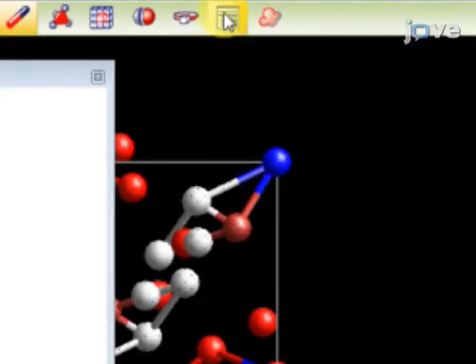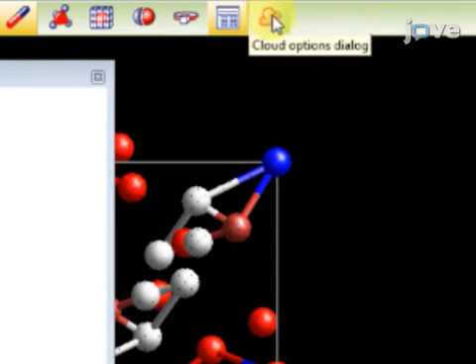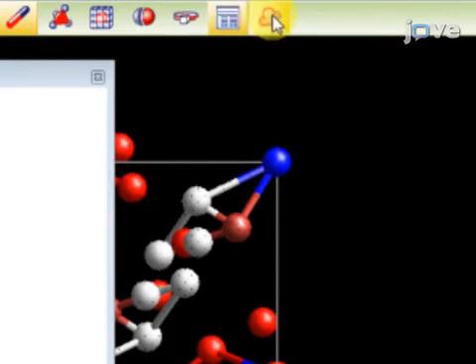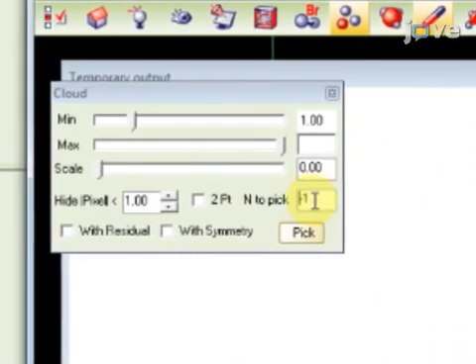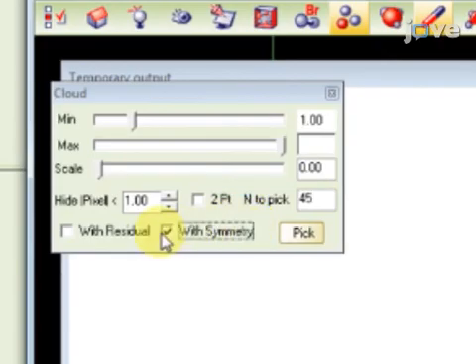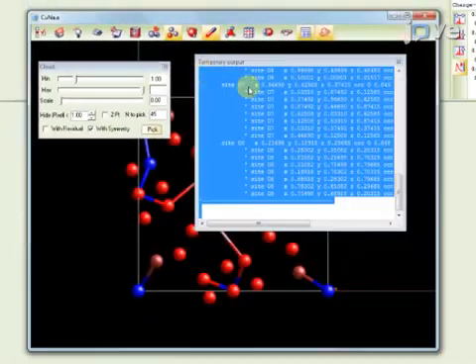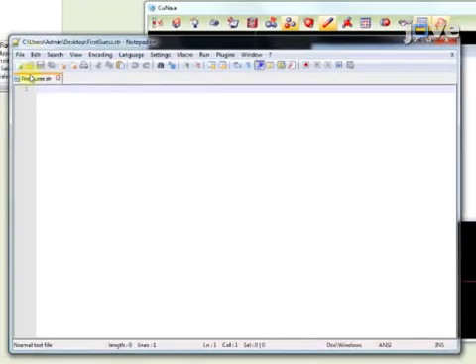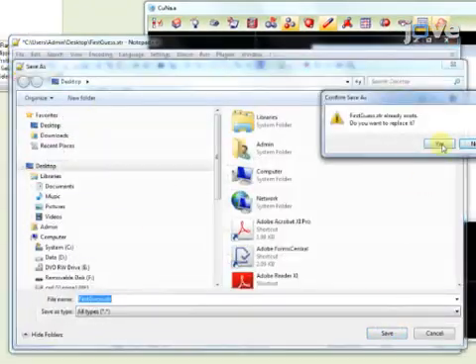Following this, press the Temporary Output window displaying Selected Atoms button, and then press the Cloud Options dialog button. Set N to pick to 45. Choose With Symmetry and press the Pick button. Copy the temporary output, save it to a text file, and close the charge flipping graphics window.